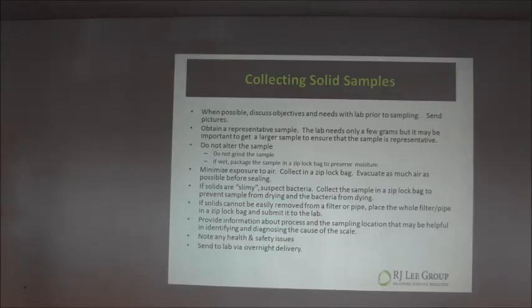Another good thought, don't alter the sample. Give it to the lab the way it is in the field, as much as you can. Don't grind it, don't dry it out. Try to give it to them the way that you're seeing it in the field. Minimize exposure to air. Some of these scales are somewhat air sensitive. I've had situations where we analyze a scale in the lab, give results to a customer, I go out and sample the scale and get a completely different result because the scale is oxidizing. Take a sample, they throw it in a pickup on the seat, they run around for a couple of weeks in heat, give it to me, and by that time you've had chemical change. So try to minimize the exposure to air as much as you can.